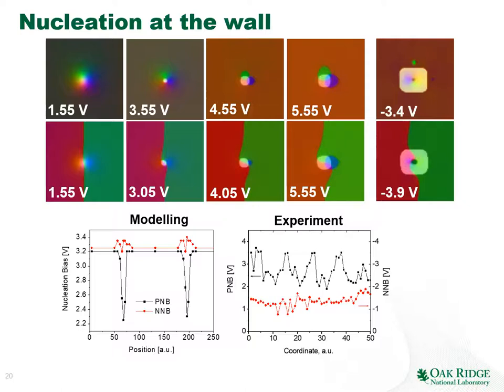And if we keep increasing the bias, we start to have this kind of flower pattern. And the reason why this happens is because the field is normal to the sample surface only directly below the tip. If we go in the radial direction, we start to have the in-plane component of the tip field. And this component can also switch polarization.